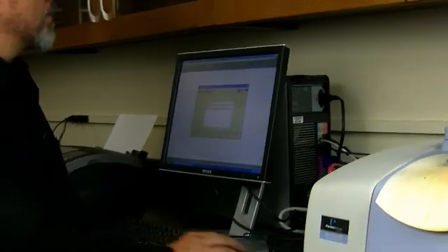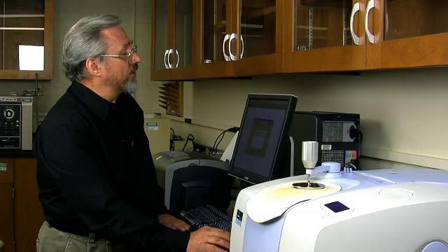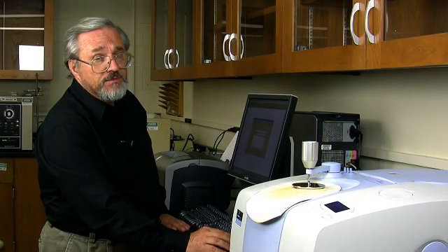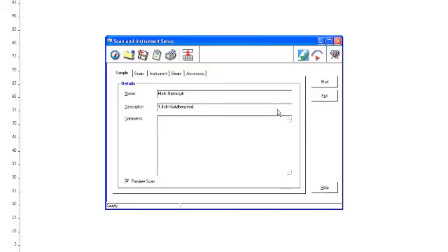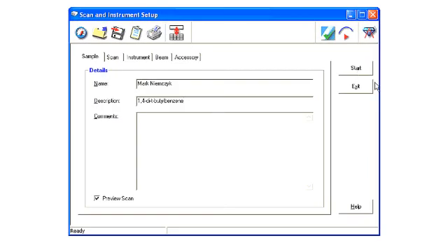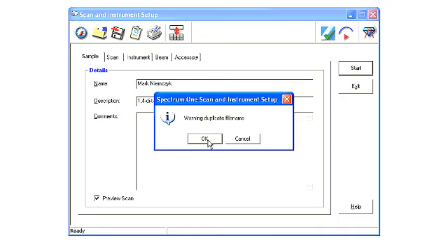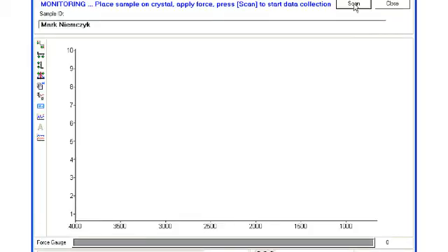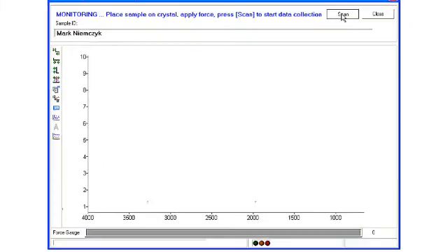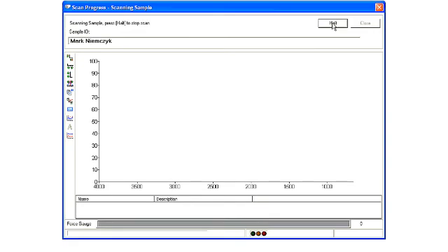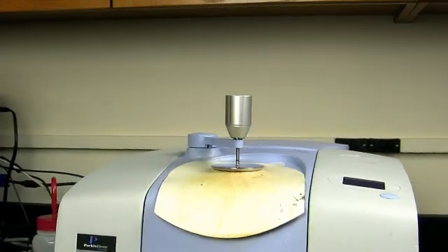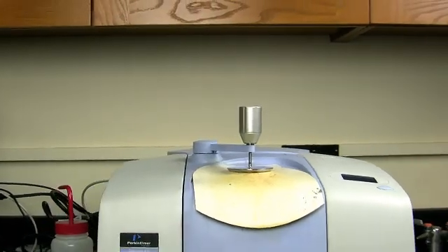Now we're going to hit the button called Start. We're going to ignore that. And then we're going to click on Scan. Once again, it's going to take four scans. That will take a little bit of time. And you can see the IR already being produced.